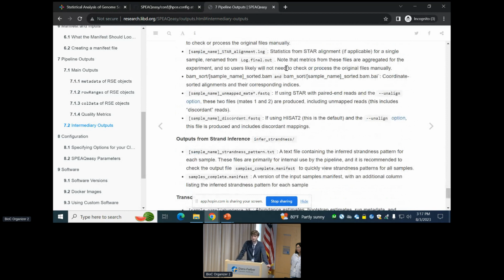Do you get flags if you had a sample that was bad? Yeah. So I guess the one way that FastQC outputs are actually directly used to make a decision is that by default, the adapter content metric is used to determine whether samples are trimmed. Okay, that would be one way. And then for the most part, the rest of that information is just collected and you move on. Once you get the outputs, you can test whether things need to be filtered or dropped.